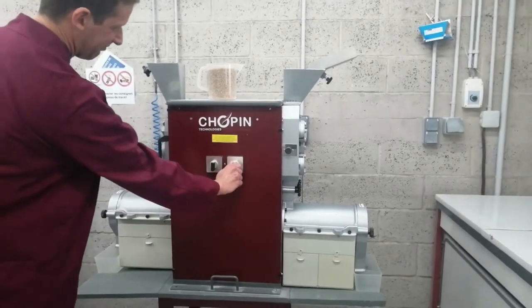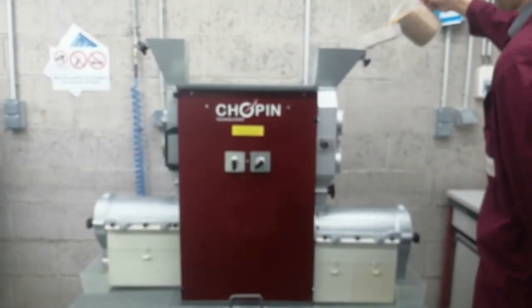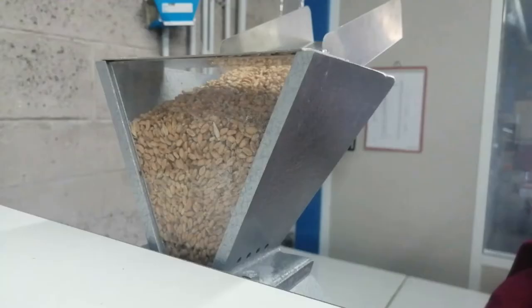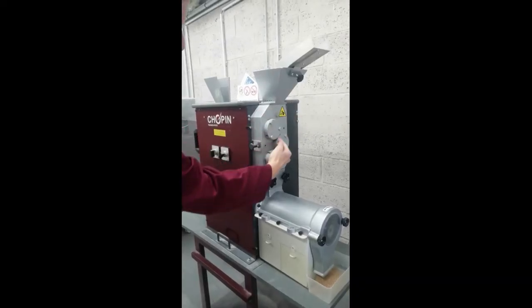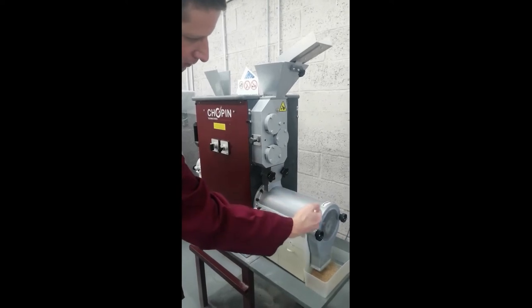Turn the knob controlling the breaking part to the right. The machine turns on and you can pour your wheat sample into the hopper through the feed chute. The wheat grains are crushed by passing between three grooved cylinders, and the resulting ground material is sieved on a centrifugal sieve.